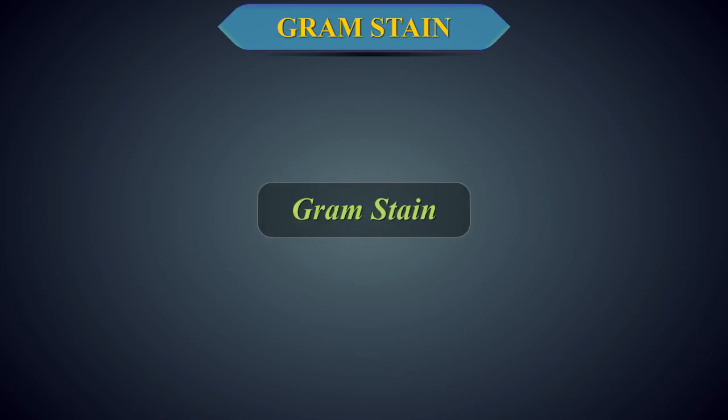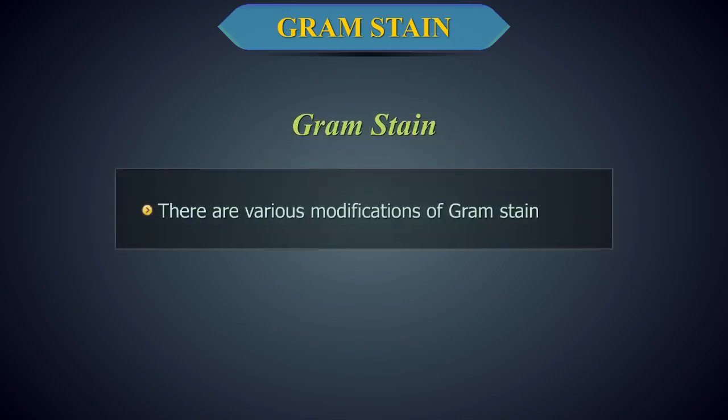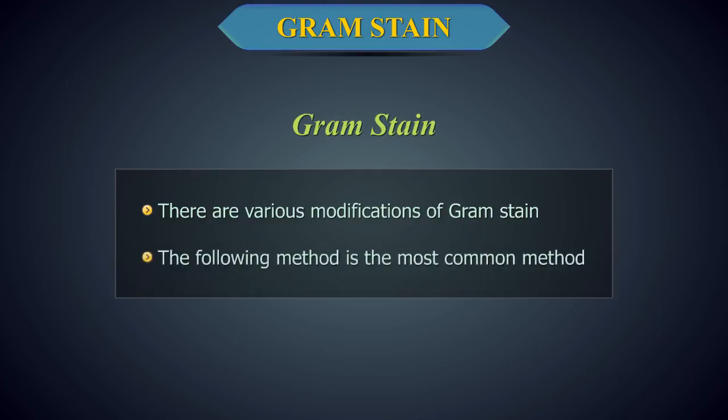Gram stain. There are various modifications of Gram stain mentioned in literature, but in-house variations can be adopted for respective facilities. The following method is the most common method used by a microbiology laboratory.